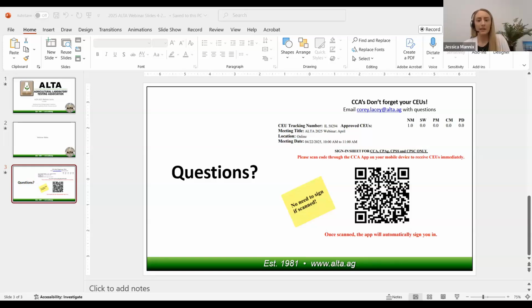Thank you. So, yeah, this project collaborated between Shiny with Elementar and Bob Miller was to evaluate and try to get an answer to your question, basically, what is the general requirement or suggestion that we would make to labs. And so, of course, like we displayed in that relationship across the organic carbon and total carbon results for the soils, the sample size also has a lot to do with it.